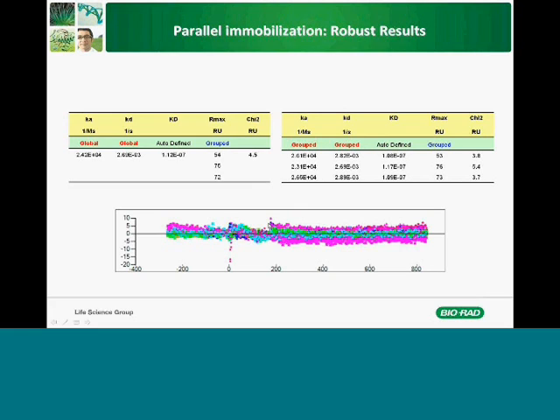And in the lower panel, you can see the residual plot, and this plot actually demonstrates for each data point of the curve, the gap or the distance between the data point and the fit. So when you see such a residual plot, where all dots are distributed evenly around the zero line, that means this is arbitrary noise, and there is very small deviation or any artifact, so the results are good.